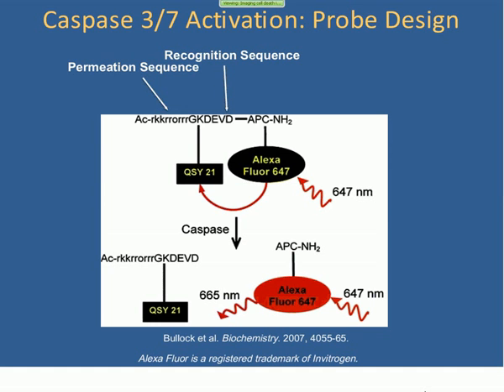So now, let's move on from radio imaging, and I'm going to speak to examples that deal with optical imaging. Specifically, we're going to be looking at fluorescent probes that can be used during whole animal fluorescence imaging. Optical techniques are emerging as a very popular strategy with which to do preclinical studies because of the ease of use of the probes.